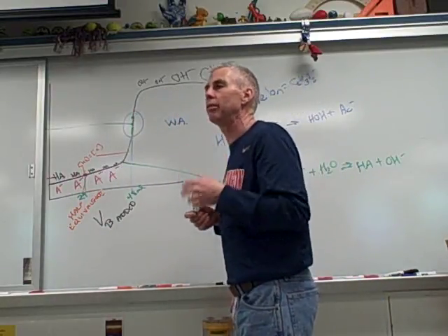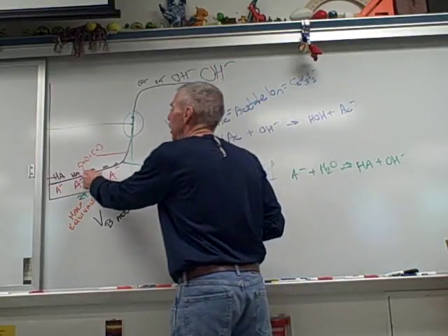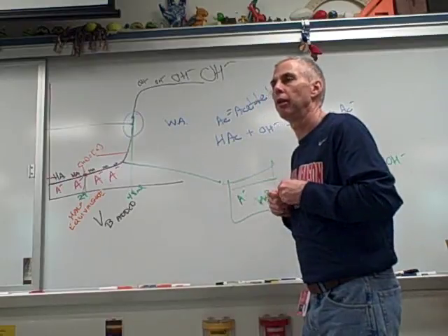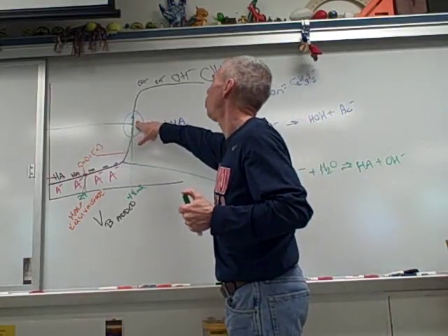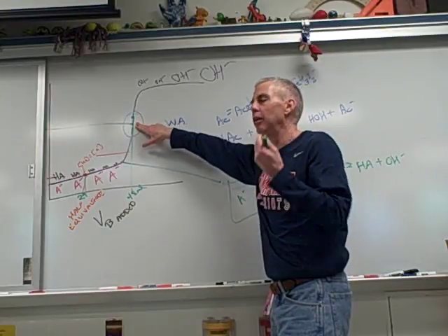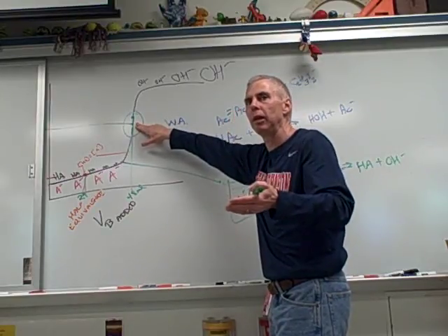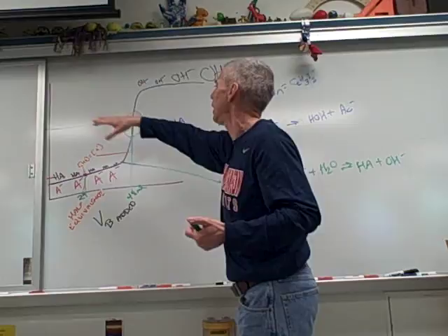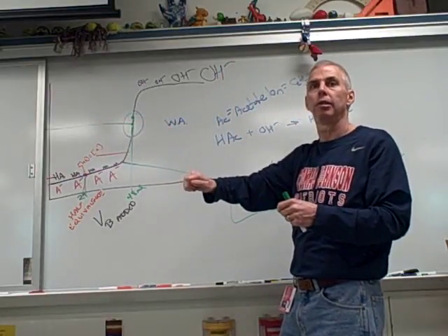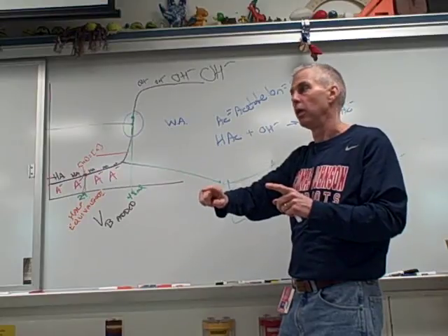If I'm going to be titrating on Monday and I really want that point, what I'm going to do is I'm going to do 2 runs. The first run, I'm just going to quickly figure out about where this is. I'm not going to write down any data. I'm not going to do anything. If I'm in my vinegar factory, I'm just going to go in and go, okay, it's about this. Right?